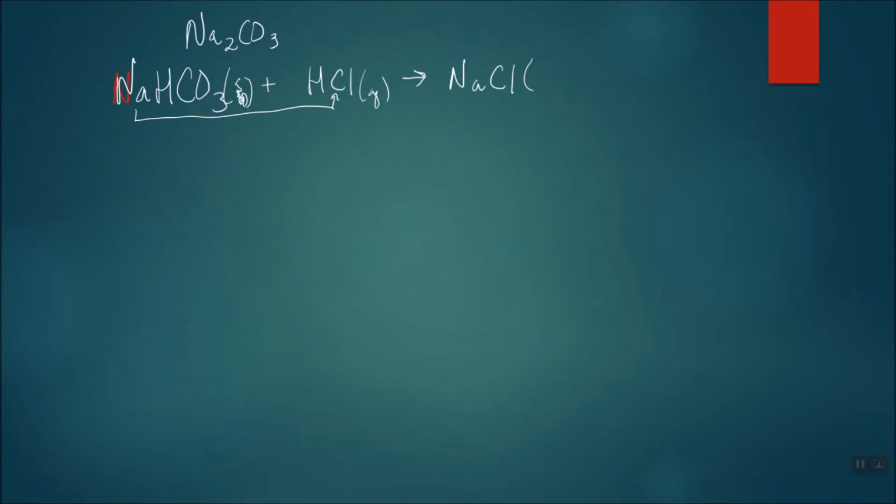Okay, so when there's a double replacement, it really results in just a bunch of sodium ions and chloride ions floating around. No big deal.